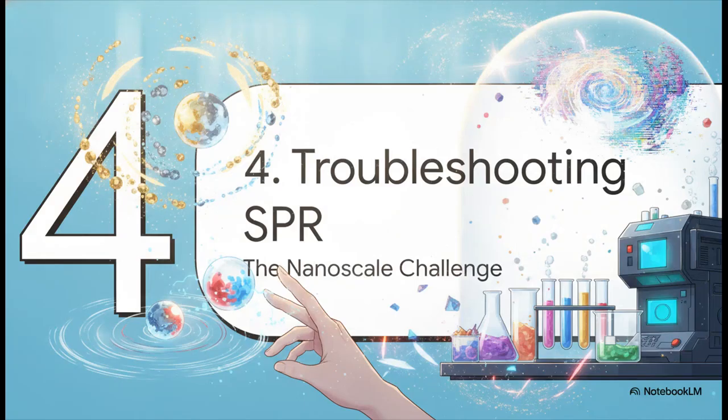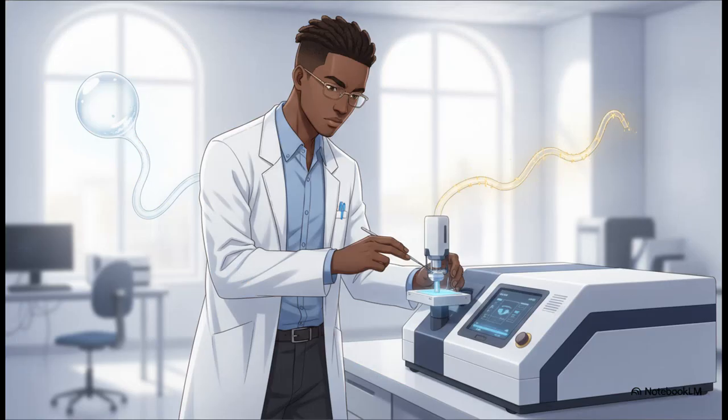Section 4. Troubleshooting the nanoscale. Of course, bringing this theoretical physics into laboratory realities comes with a few headaches. When you're detecting protein amounts so tiny they're sub-femtomolar, which is almost unimaginable, even the slightest environmental factor can completely ruin your data. If your baseline signal starts drifting, it could be something as simple as a microscopic air bubble.